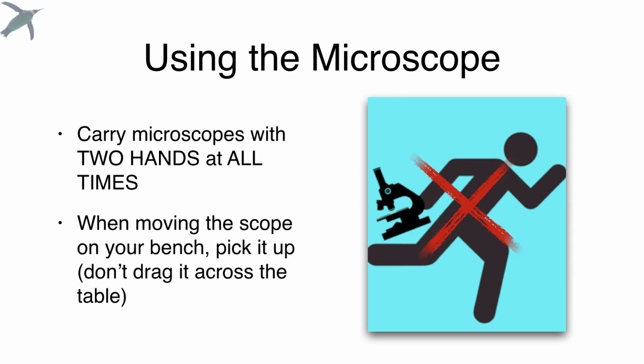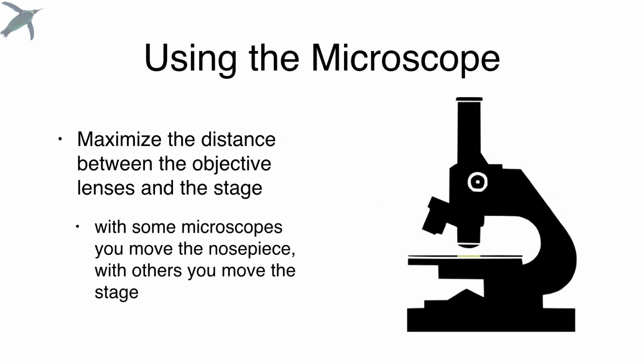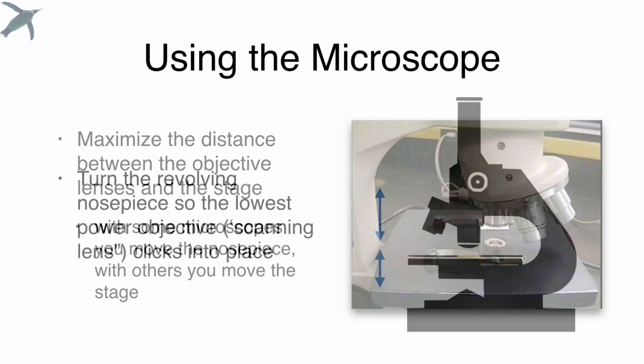When you use the microscope, please always use both hands when you carry it. Even when you move it around on the table on your lab bench, go ahead and pick it up. Don't drag it across the table. It makes that horrible bouncing sound, and that's probably the condenser getting out of alignment. When you sit down to use it and you plug it in, the first thing that you want to do is maximize the distance between the objective lens and the stage. Some scopes, you will move the nose piece up and down with respect to a fixed stage, and other microscopes, you actually move the stage up and down against a fixed nose piece. Either way, you want to increase that distance between those two when you're getting started.